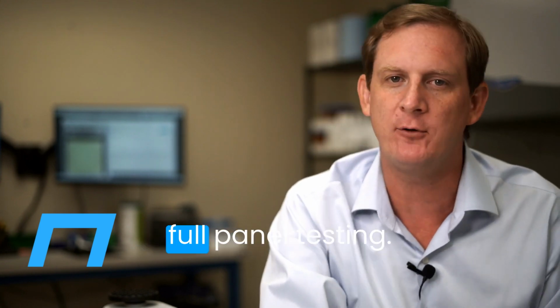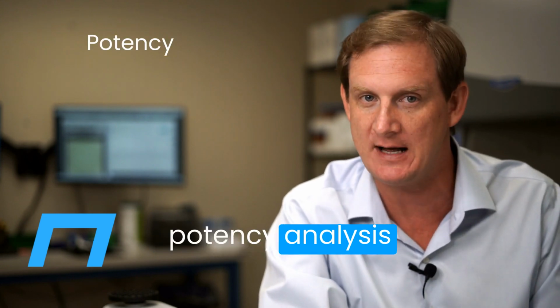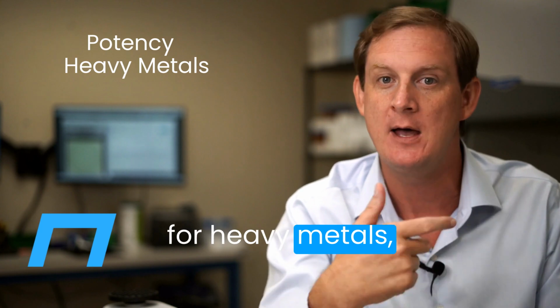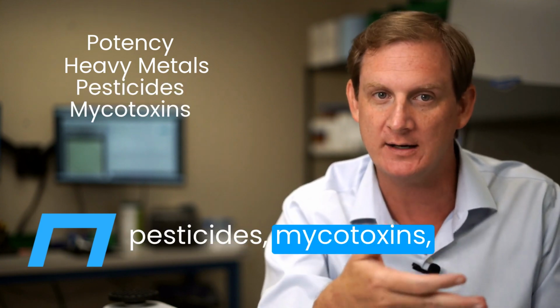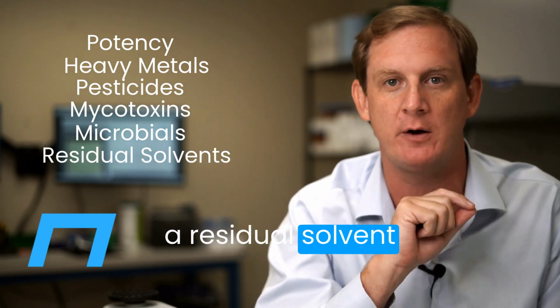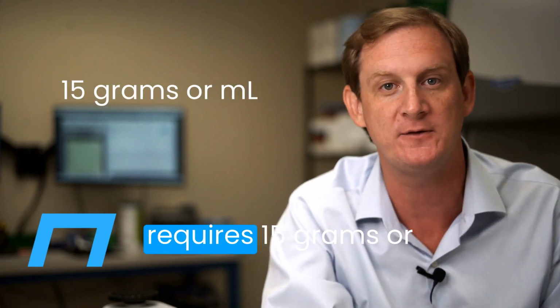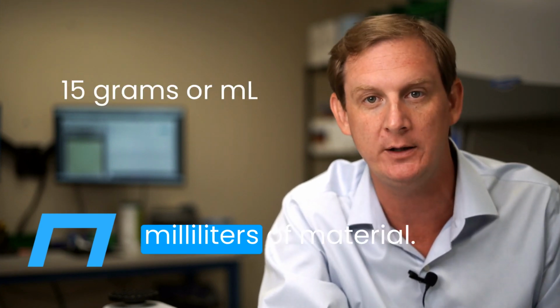Now let's talk about full panel testing. A plant material full panel test includes potency analysis and screenings for heavy metals, pesticides, mycotoxins, and microbials. And for processed material, we include a residual solvent screening as well. In all of these cases, a full panel requires 15 grams or milliliters of material.